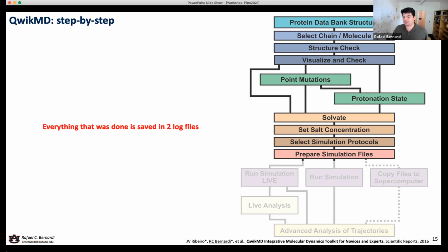a method section of your paper. It's not perfect, the text, but it gives you all the parts. You just put in the words that you need to link the things together. It makes your life easier.